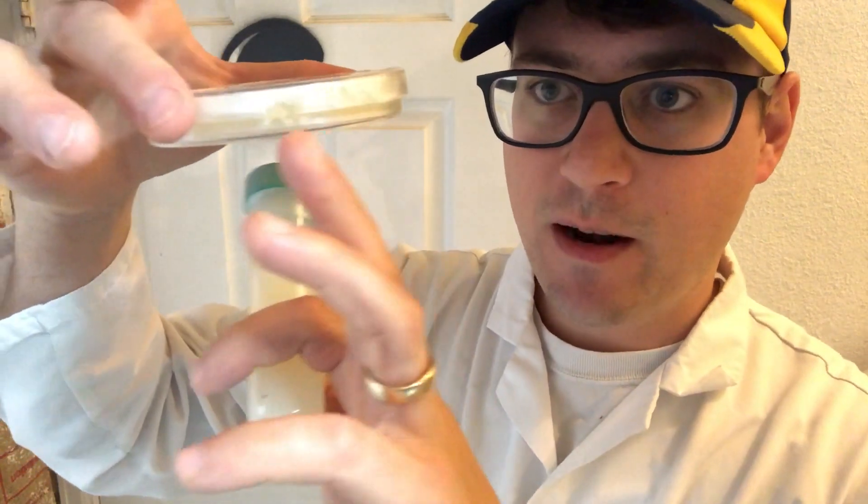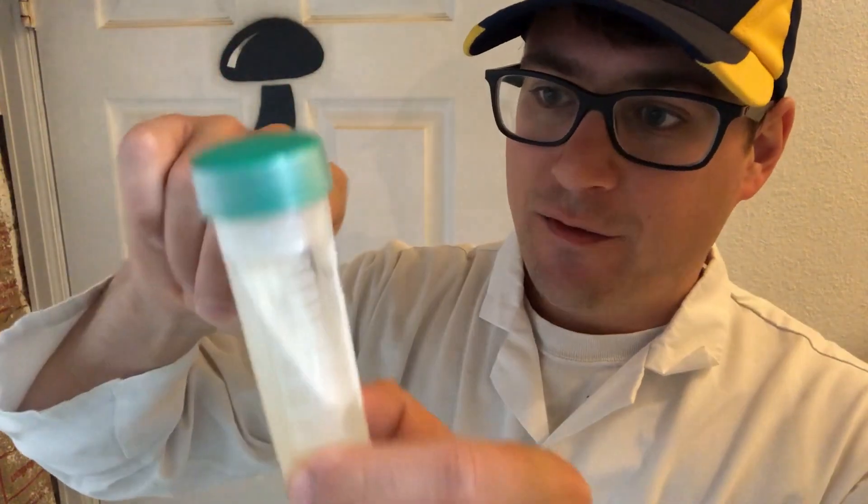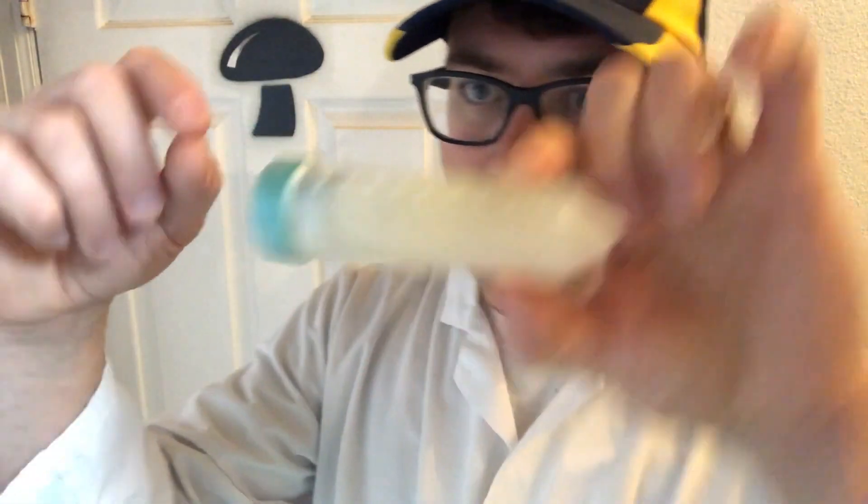A petri dish has the same amount of nutrients throughout the plate, so there's an even distribution of nutrients going through the mycelium. That's good because you want each wedge you cut to be consistent with the next wedge so that your production is consistent. When taking from a slant, I usually take from the top because it has the least amount of contamination.